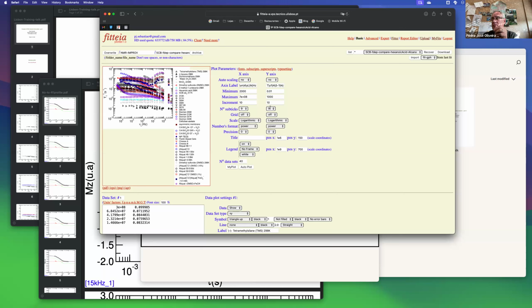So there is what we call spin diffusion. In this case, all the hydrogen nuclei will be communicating, all the atoms through dipolar interaction, and there will be a common relaxation of all the system to the network.